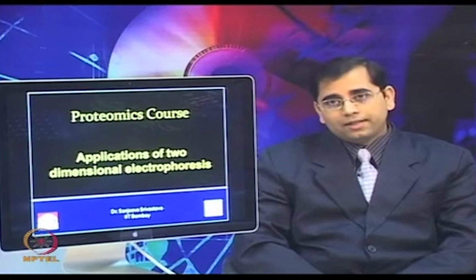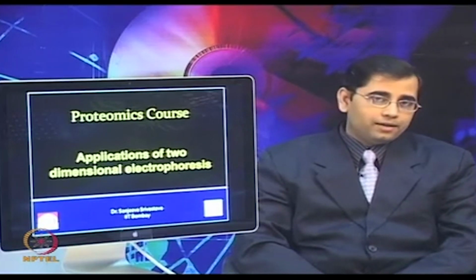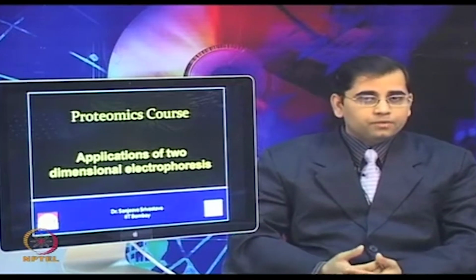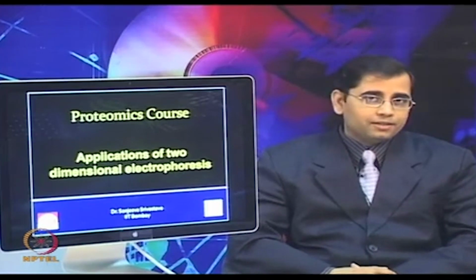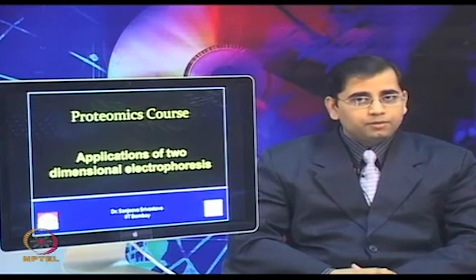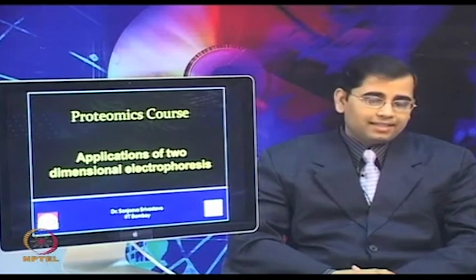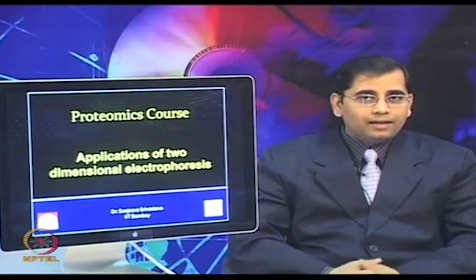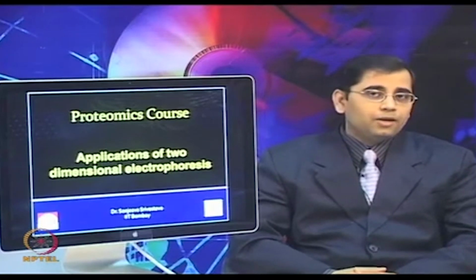Now, this is time for us to assimilate all the knowledge which we have acquired during the last several lectures. For example, what are the things one needs to take care of during protein extraction, then isoelectric focusing, second dimension protein separation, followed by gel analysis. So, all of this knowledge integrates when you want to apply these techniques in any biological application.